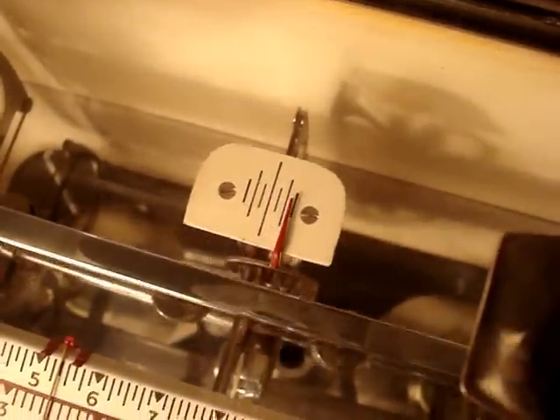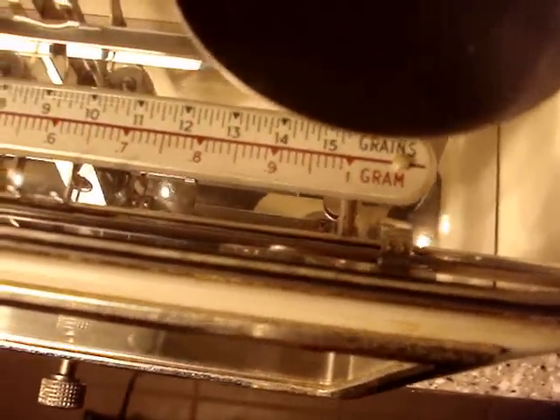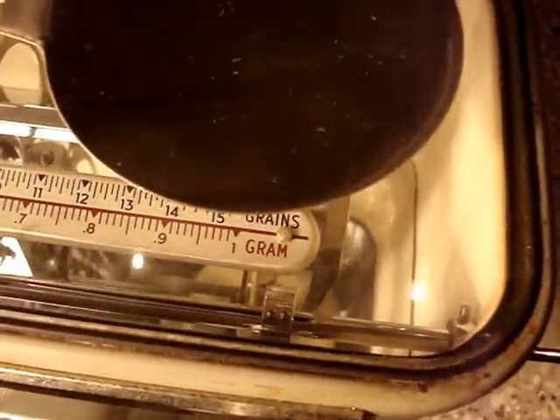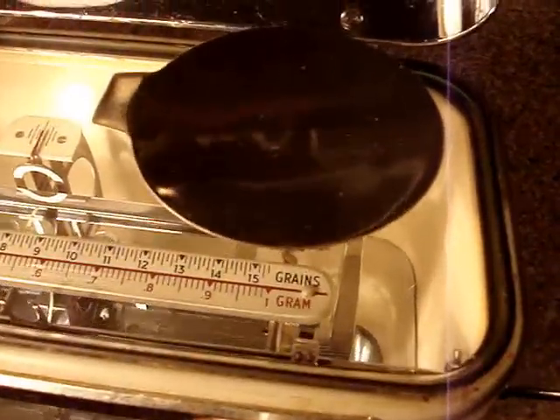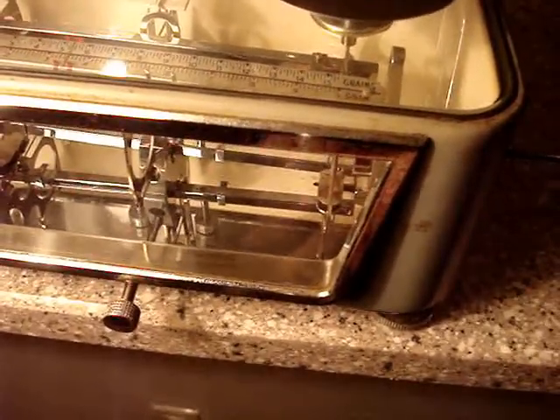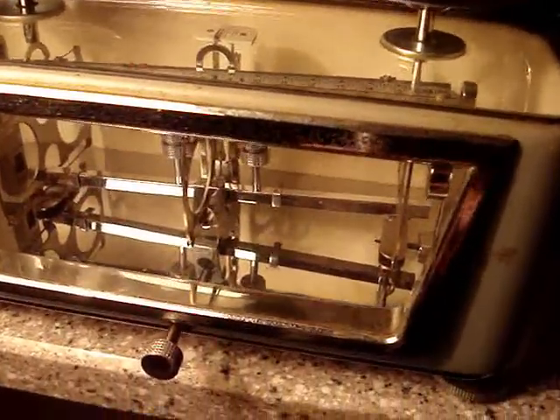Let me show you what it looks like over here on the right. I'll zoom out a little for you. There's the right side of the beam, and you can see where the capacities are marked on the right-hand side. Most of the light is coming up from the inside of the scale. I've got a big photo lamp here, and you can see the mechanism inside if you're looking closely. There's the front view of the scale — let me tilt this down a little for you.